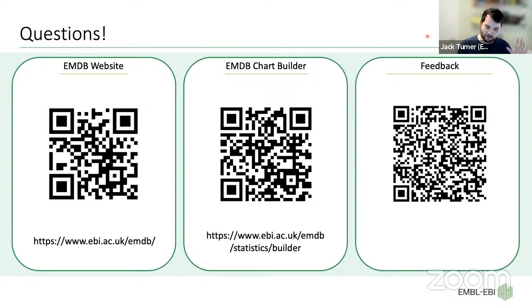So the idea is that we would hope to collect enough metadata on the side of EMDB, and I think in many ways we already do, although not all of it is mandatory, and we do need to review that, to give you all the information you need for how that reconstruction was created. And then you can look at the EMPIAR entry and hopefully make use of that. There are, of course, certain things that depositors don't have to provide, such as particle picking positions and things like this, which may be of interest. But in theory, there should be enough information between the EMDB and EMPIAR to regenerate, at least in some way, the data that's in EMPIAR. But yeah, I can feed back.